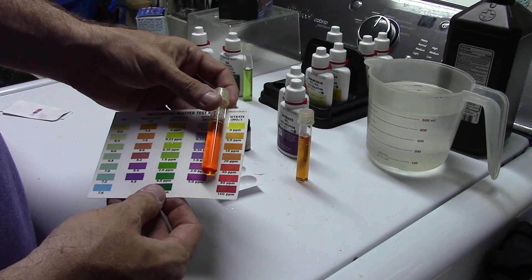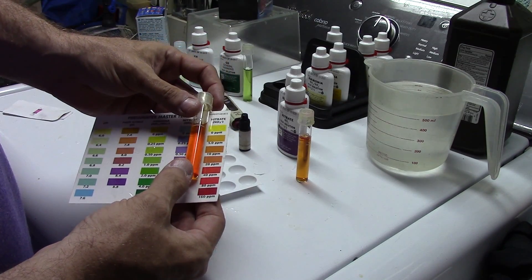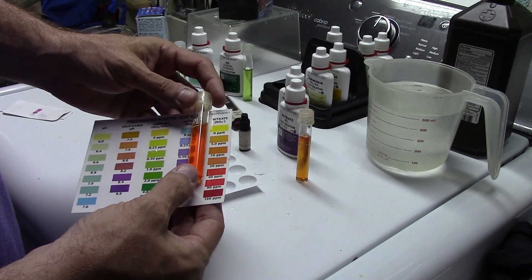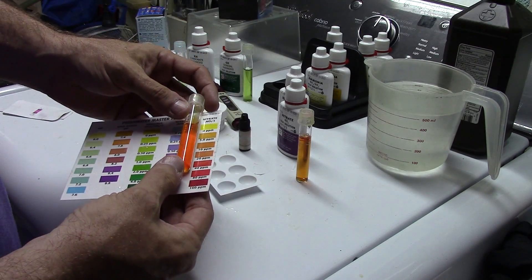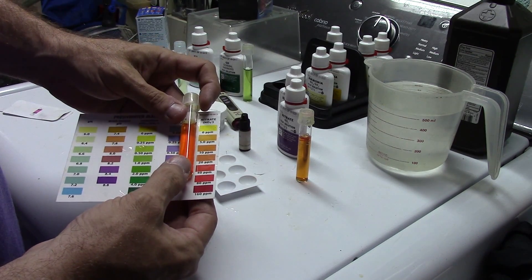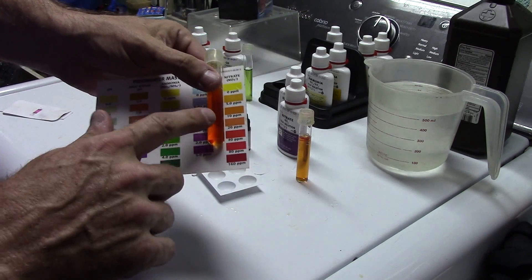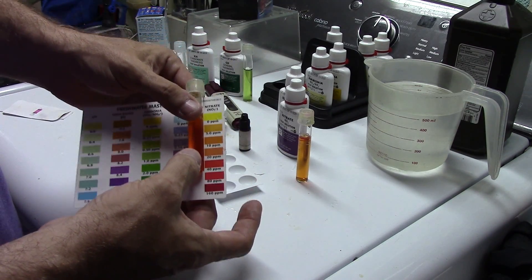I'm not actually going to worry about comparing these because I can see how orange it is — it's not a very high number at all. Again, this is not my water; this is the water the animals came home from the fish store in today. We're sitting right around 20 parts per million, maybe a little less than that.